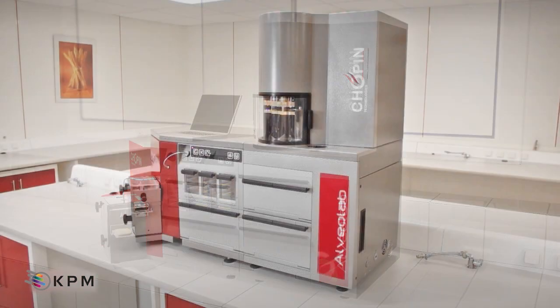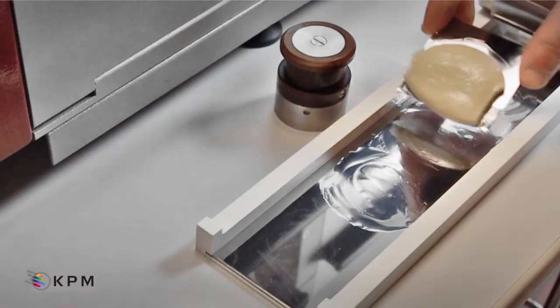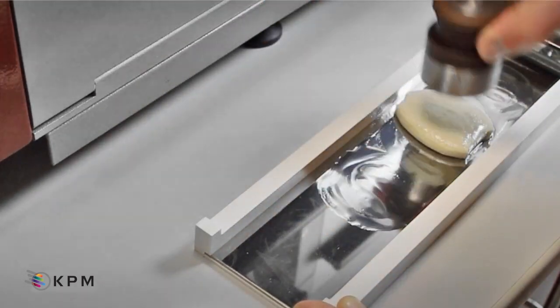Some examples of these innovations are automatic pump calibration, automatic water injection, new accessories such as resting plates and a dough cutter to better control the preparation of dough pieces.